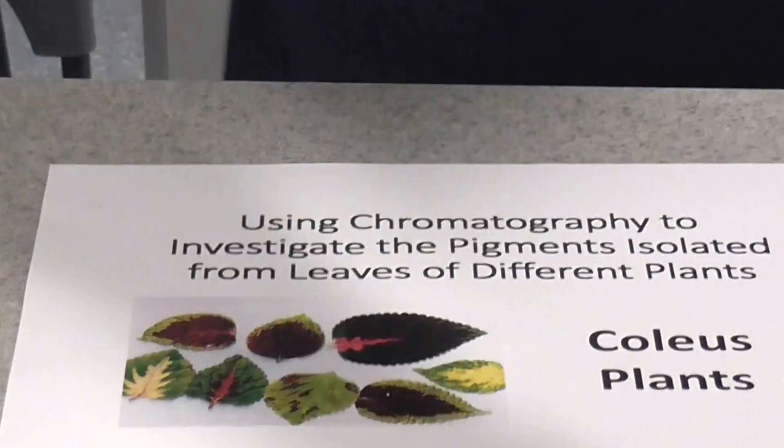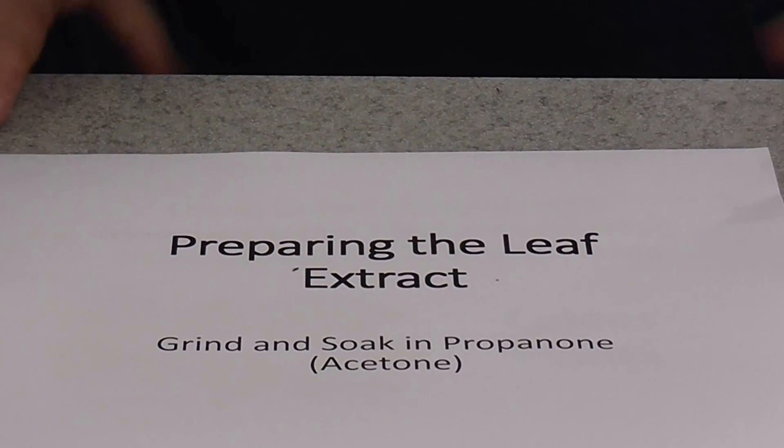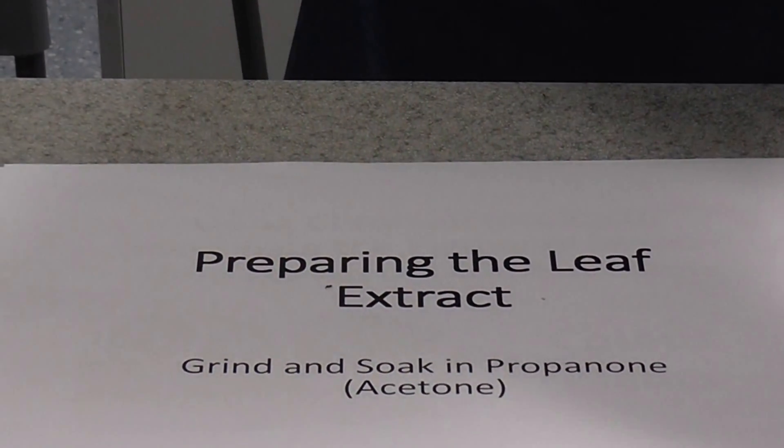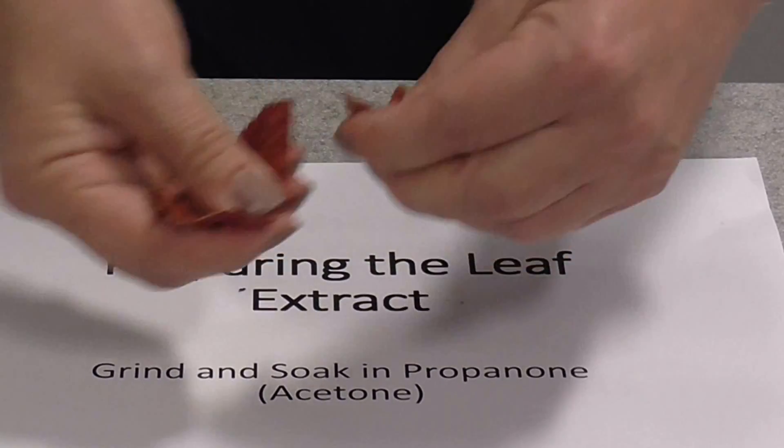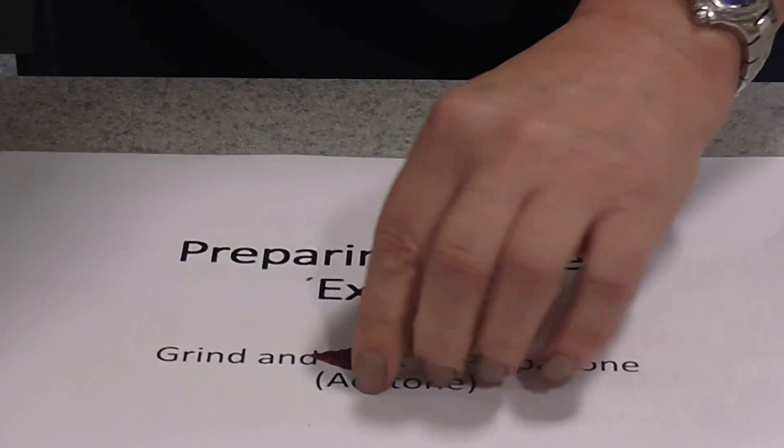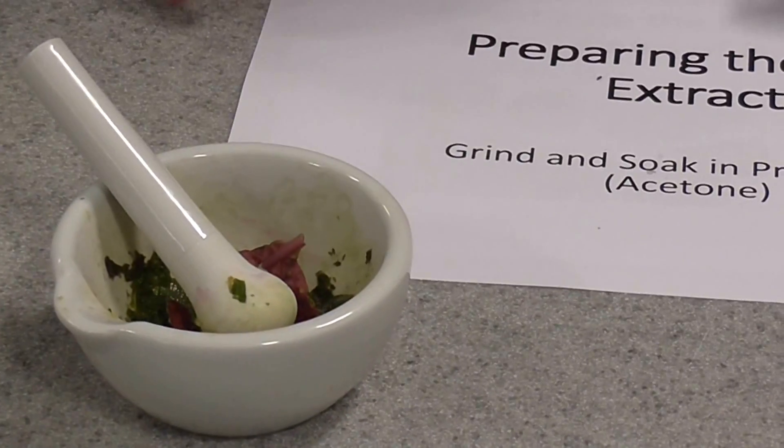Now then, the first thing that you need to do here is to actually prepare a leaf extract. And to do this, you're going to take a couple of little leaves off your plant, whatever you've chosen. I've got coleus leaves here. Tear them up and put them in a mortar there. Okay, now you can see I've already been doing this.